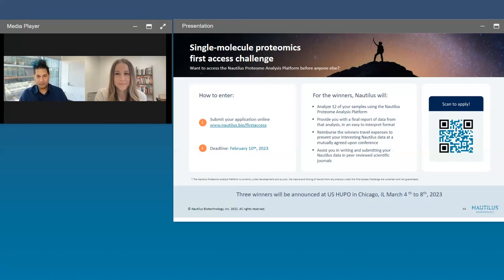Super, that's a great question. The assay is absolutely quantitative. What's really special about it being a single molecule based technique is that on a per molecule basis, you are making an identification, you're making a detection, but then quantitation comes from summing up all of those identifications, literally counting. So if I make 100 counts of a given protein, I sum that up and I say I had 100 molecules present on the chip. And so it absolutely can be used quantitatively. One can potentially think about adding additional calibration standards as well on top of that. But definitionally, as a single molecule counter, it is quantitative.